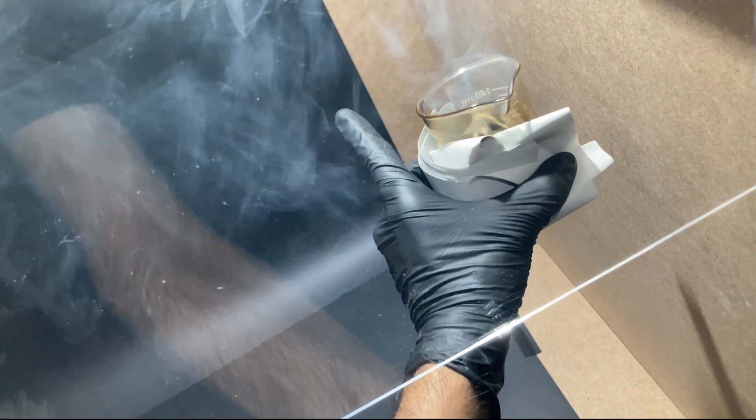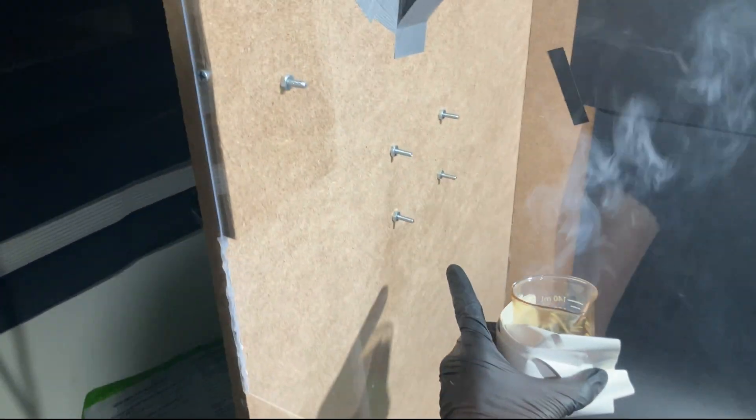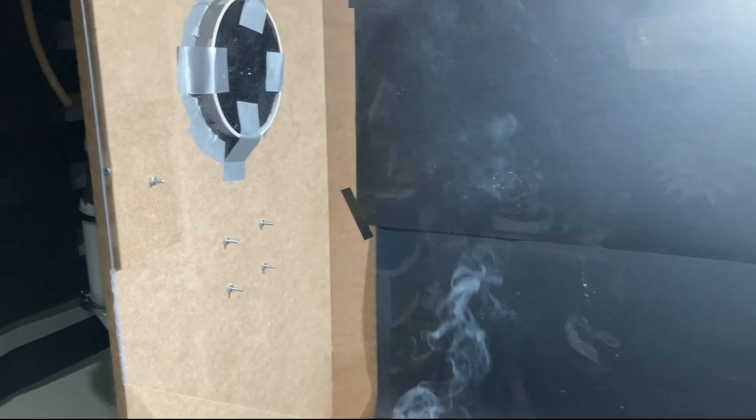So let's start with the basics — how does a fume hood actually work? Well, it's simple. A fume hood is just a chamber attached to a fan that constantly removes the air from the inside, preventing the accumulation of dangerous fumes. That means all you need is some kind of box with a hole on one side and a fan.